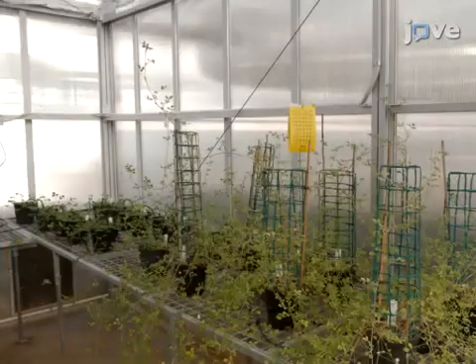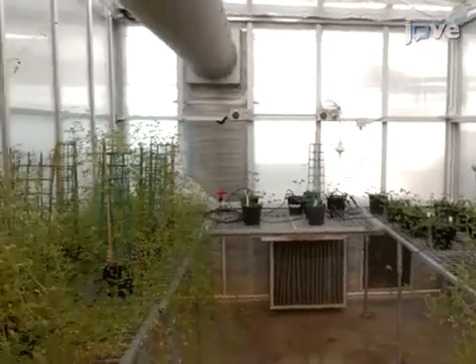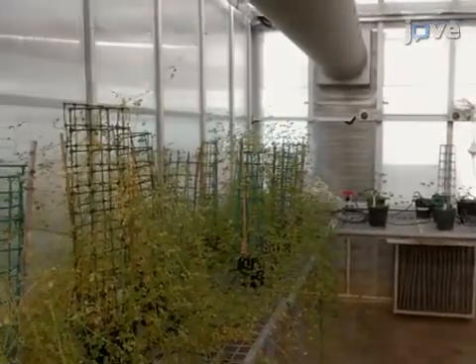Grow the plants under a 14-hour photo period with a 23 to 19 degrees Celsius day-night temperature, retaining the healthiest seedlings after germination.